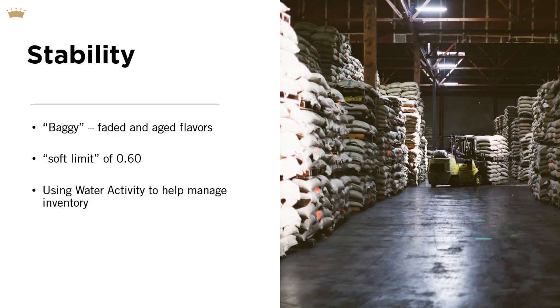As a coffee buyer or inventory manager, you can use water activity to help your decision making from a quality preservation perspective. If a coffee is shipping from a country of origin and the same sample prior to shipping measures with a high water activity, the buyer may wish to pay for additional drying time or for expedited shipping, or select a different coffee with a more stable reading. Once a coffee arrives at its final destination, prioritizing coffees with higher water activities for roasting and usage can ensure that the user is vacating the inventory before the flavors begin to fade.